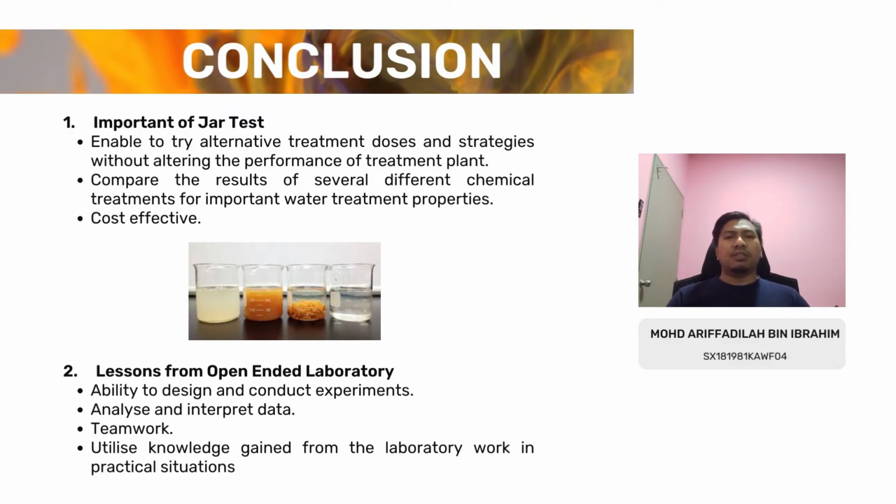Another important reason to perform jar testing is to save money. One of the common problems in water treatment is overfeeding or overdosing, especially with coagulants. However, jar test enables the correct choice and dosage of chemical coagulants to remove suspended matter and pollutants in water that is treated in wastewater treatment plants.